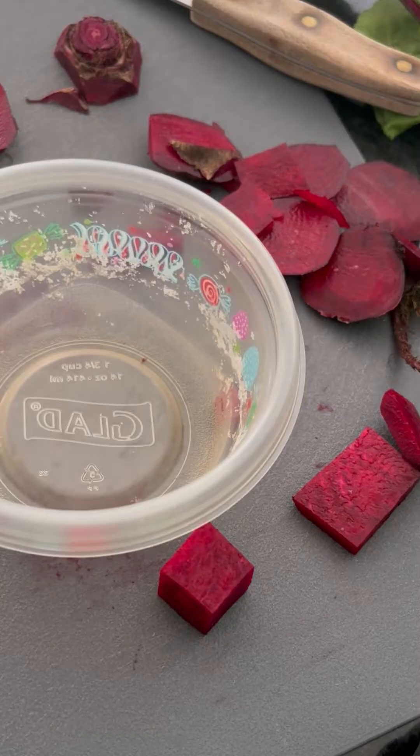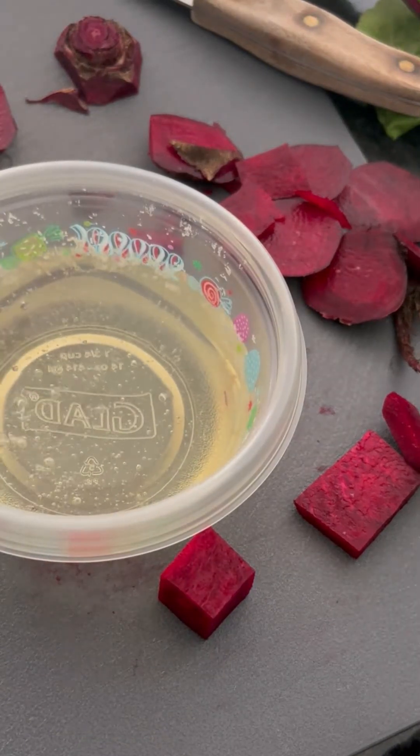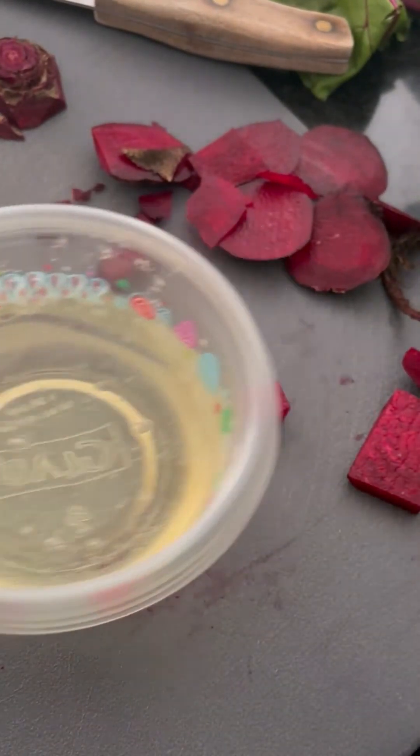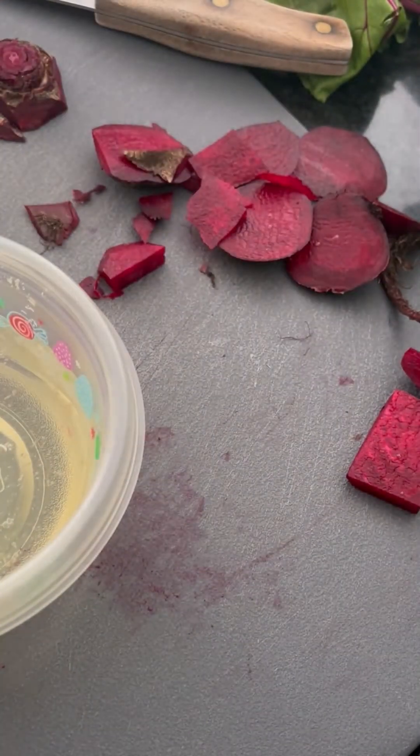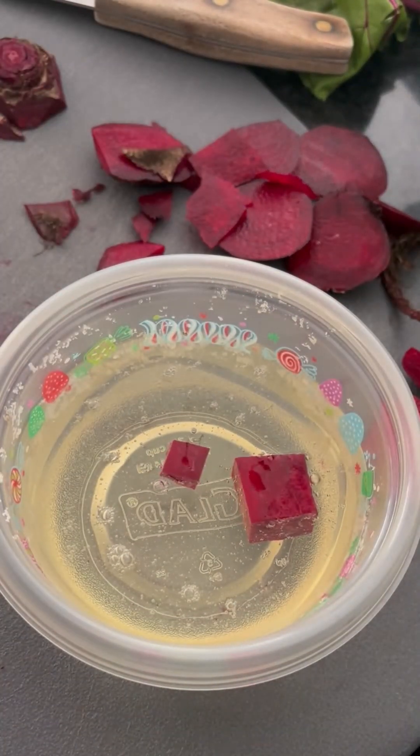Then we're going to soak these in bleach for about an hour and a half. You can turn them after they've sat for a little while, because they have a tendency to float so the top surface doesn't get soaked as well.